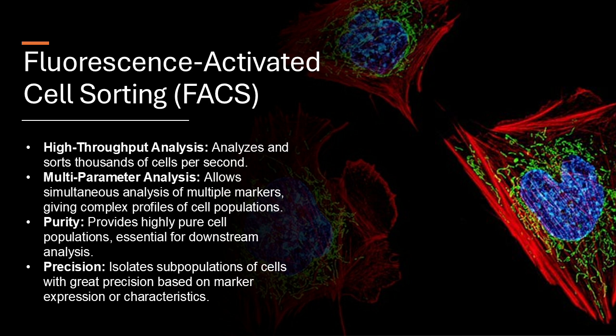Are there any specific guidelines or regulations to ensure that FACS is used ethically? Yeah, there are. There are ethical guidelines and regulations for research involving human cells and tissues, and that includes those used in FACS experiments. These guidelines are meant to protect the privacy and safety of individuals and make sure that the research is done ethically.